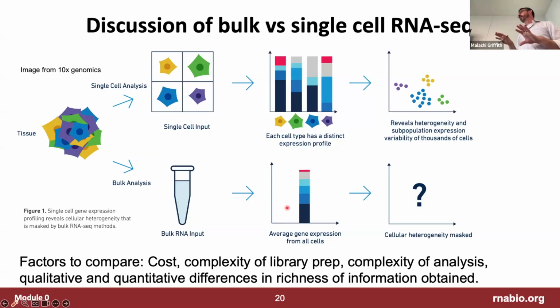at this relatively low level of sampling. And if you just look in the QC outputs from your experiment, you can see how many reads did I get for each of my cells and how many genes were detected. And then it's simple math. You can say, well, how many counts would that be for each gene if I just did a simple average? And the numbers are often quite low.